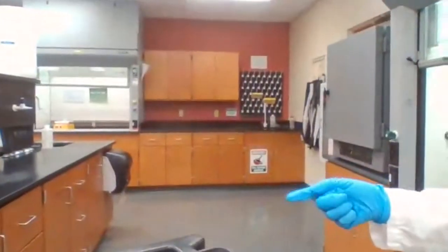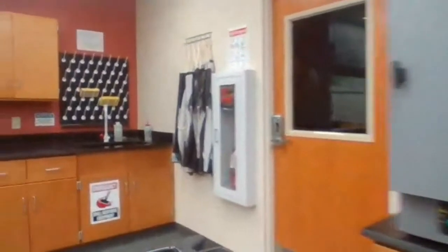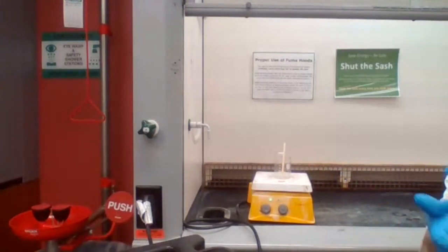Okay, we have one concern. You don't want to dry the sample to decomposition. So we have to watch this constantly. This is a good time to answer your questions while we are monitoring this.